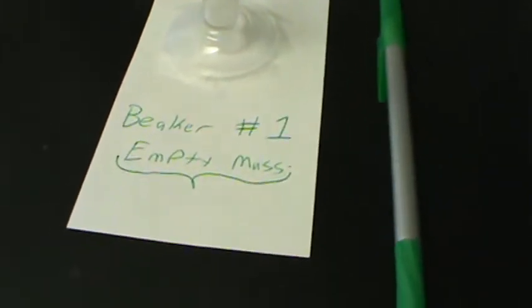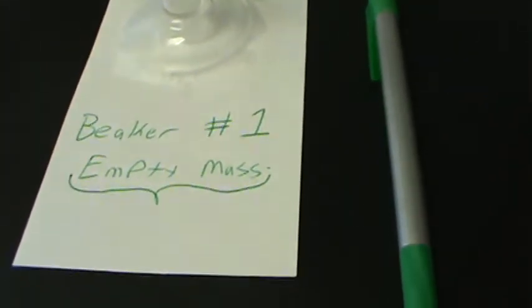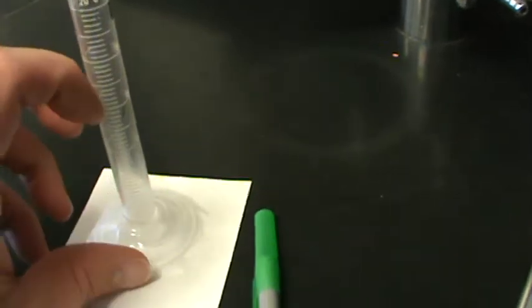Everything's going to be set up over here in this part of the room, and I'm not there yet. I'm working on it right now. But that's good because I want you to see how this is going to go. Normally, if we had the time and the space, I would have you just take these graduated cylinders, these small ones, and fill them with a liquid and do this lab.